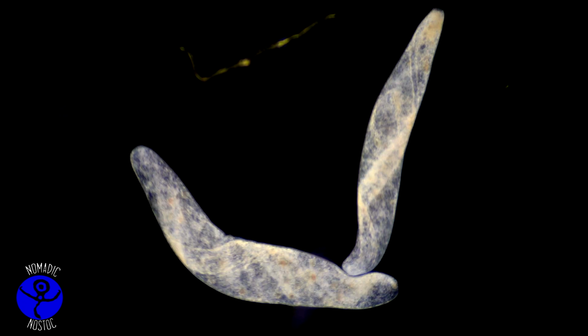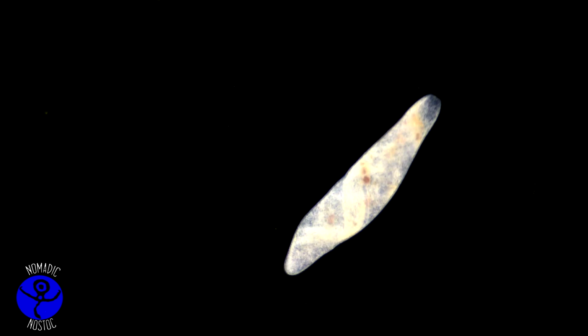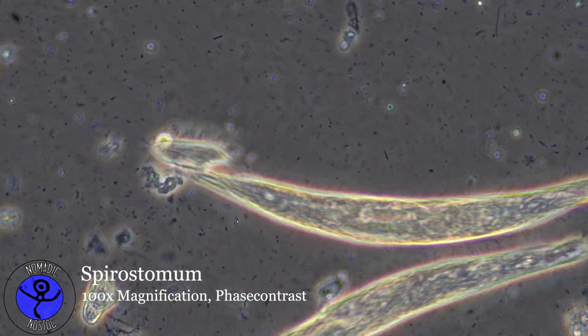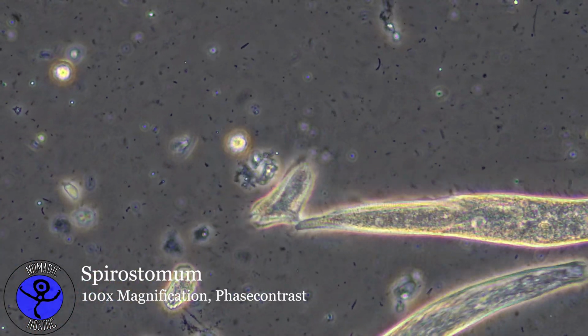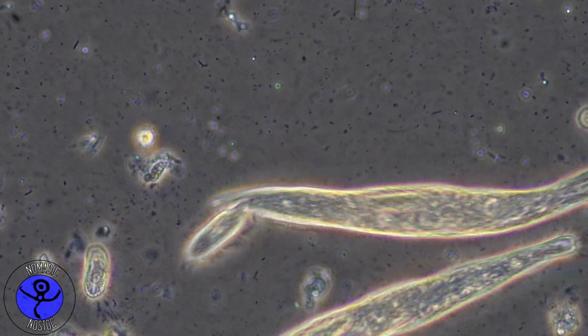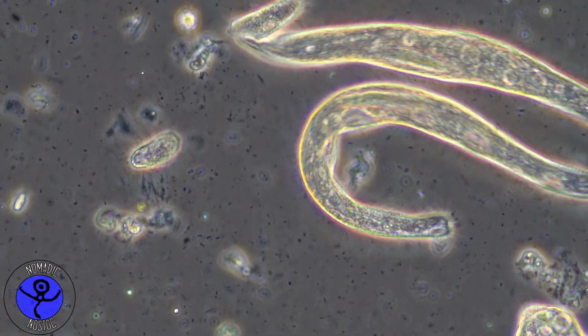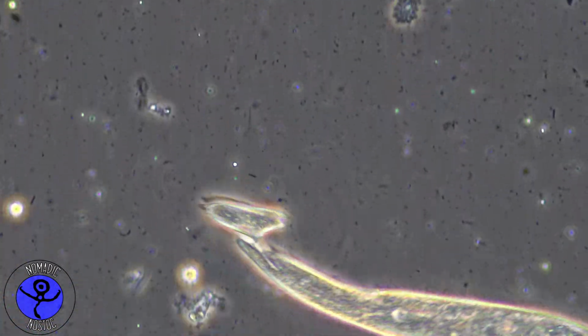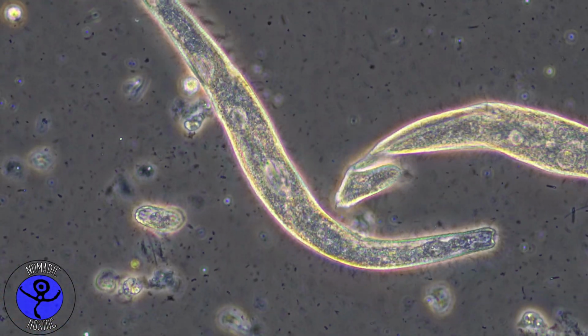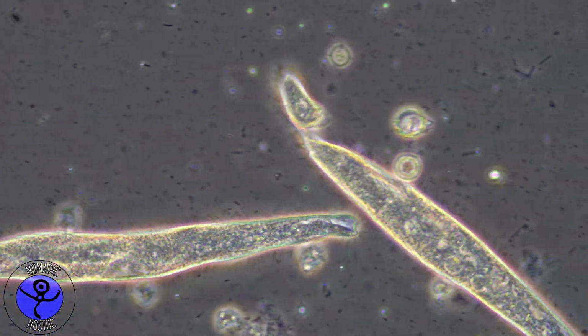However, while I was looking at some Spirostomum individuals, I came across this. I don't know exactly what happened to it, but it started to lose its head. And not only that, it started literally to get rid of it. It started to be annoyed by its damaged body part. I mean, I know they don't have heads, but it would be basically the head part. It's the direction in which they swim.